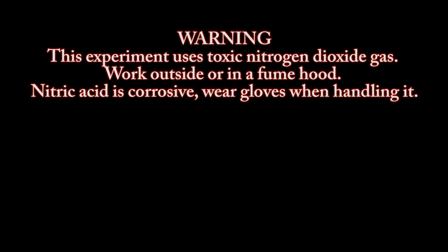Warning. This experiment uses toxic nitrogen dioxide gas. Work outside or in a fume hood. Nitric acid is corrosive. Wear gloves when handling it.